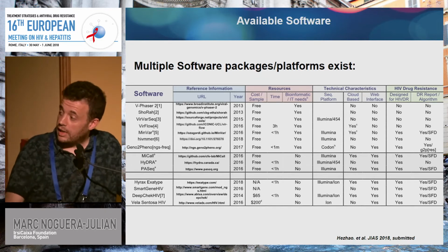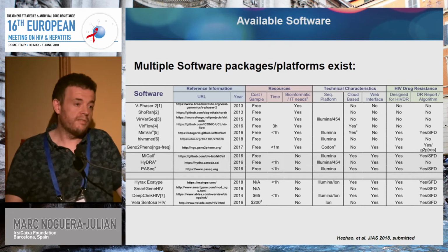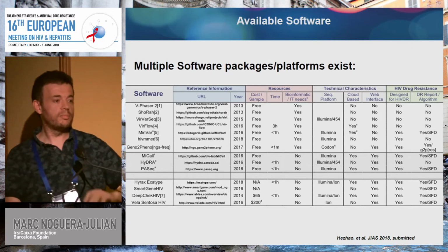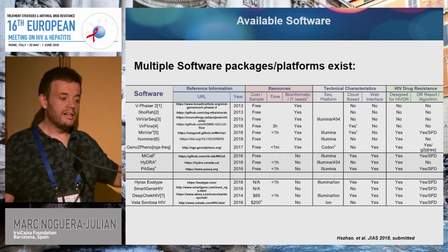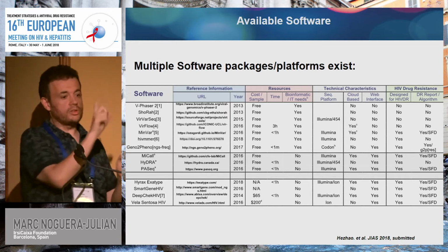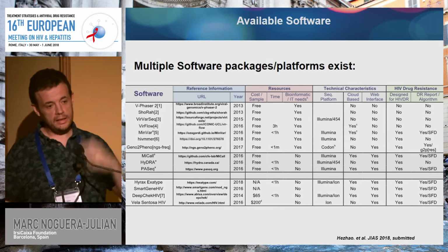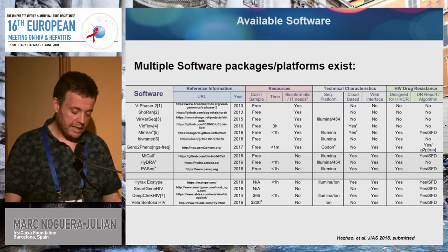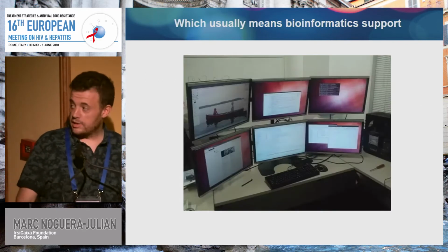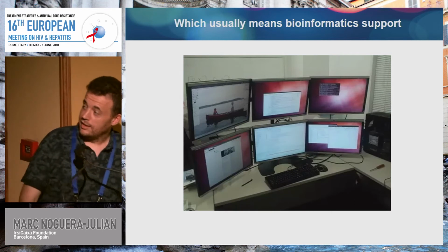And the three in the middle are those that have a web interface, and they can work essentially from the very beginning, from the very raw files that come out from the sequencer. So basically you just drag and drop the files from one place to another and click a button, and all the data processing comes through. Okay, so this is what we want to avoid, particularly someone sitting there as well.